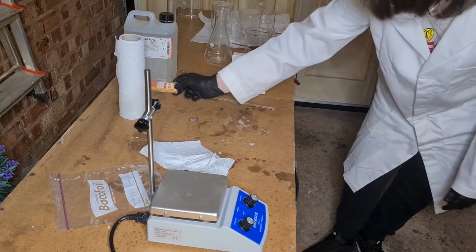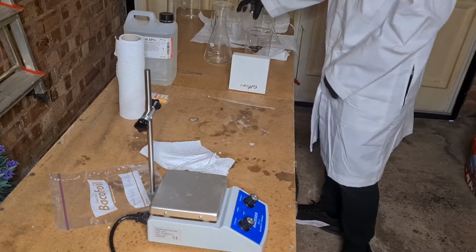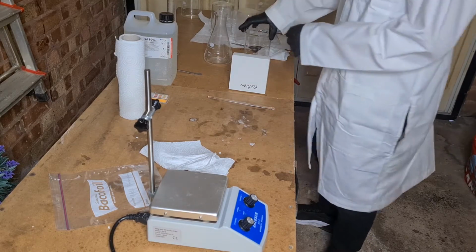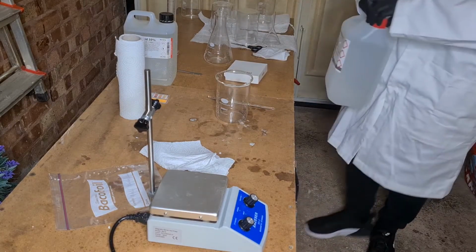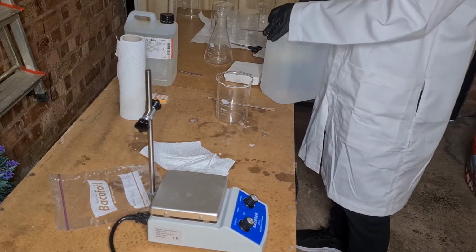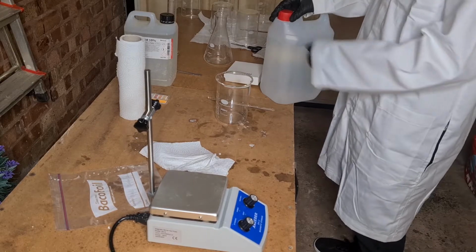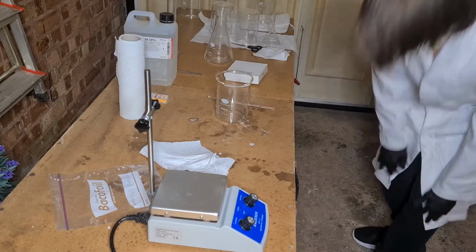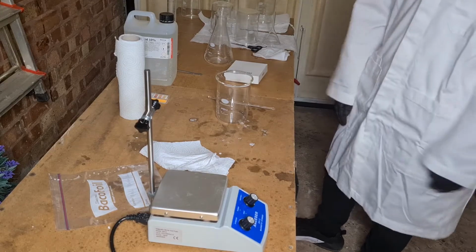So, there are 2 methods I can take, and the first time I tried it, I completely messed it up. And that was grabbing a beaker, this one's not quite clean, I should probably wash those off again. Grabbing a beaker, grabbing your deionized water, and just pouring some deionized water into that. Now, that's harder to get it right because you can add an excess of hydrochloric acid and just send it down to pH 1, which is not something you want to do. So what we're going to do is this is a bit more wasteful with the acid though.